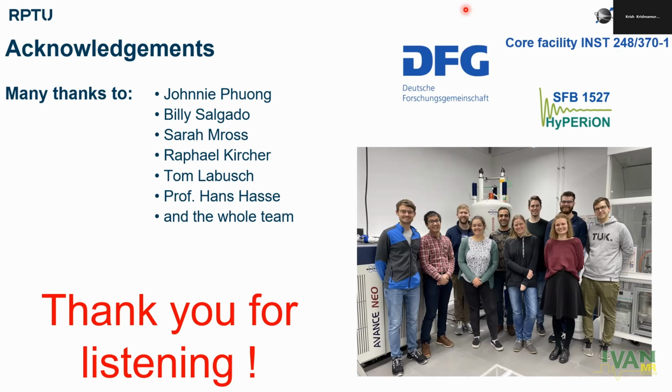Yes. Thank you, Patrick. Kerstin, that was fantastic. I really enjoyed this talk. I'm particularly impressed by the reproducibility aspect of this method. So the question I have is more like a blue sky, perhaps. Considering that your ODNP happens on both carbon and proton, is there a possibility of being able to do one shot per increment 2Ds and exploit the Polish methodology?